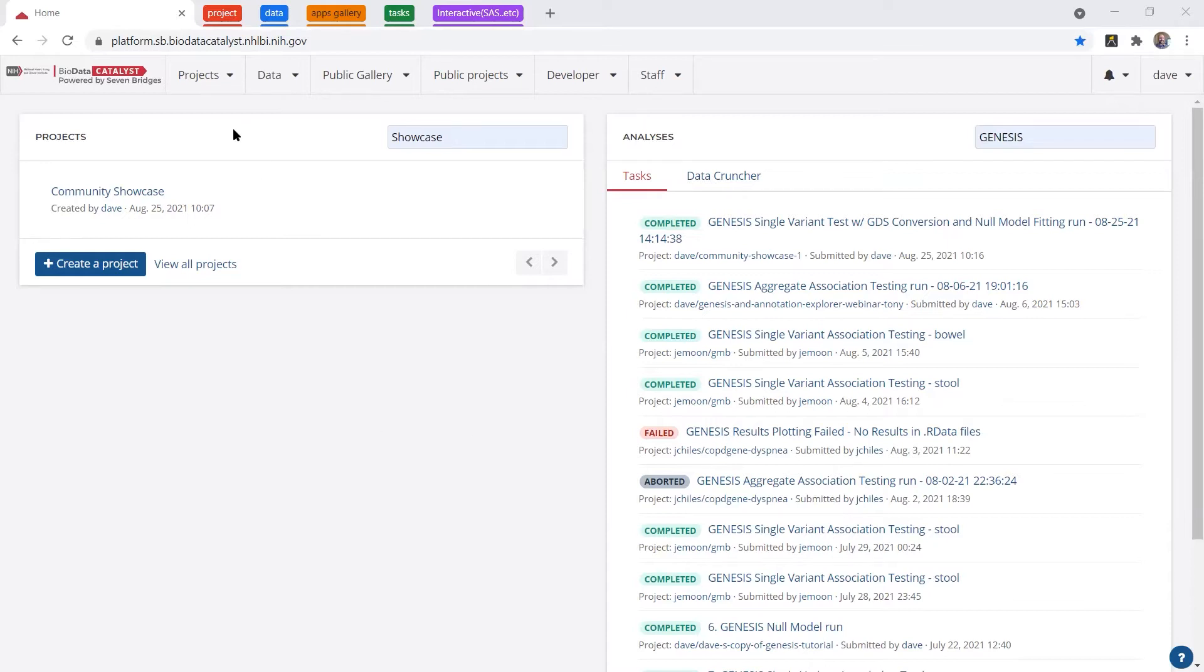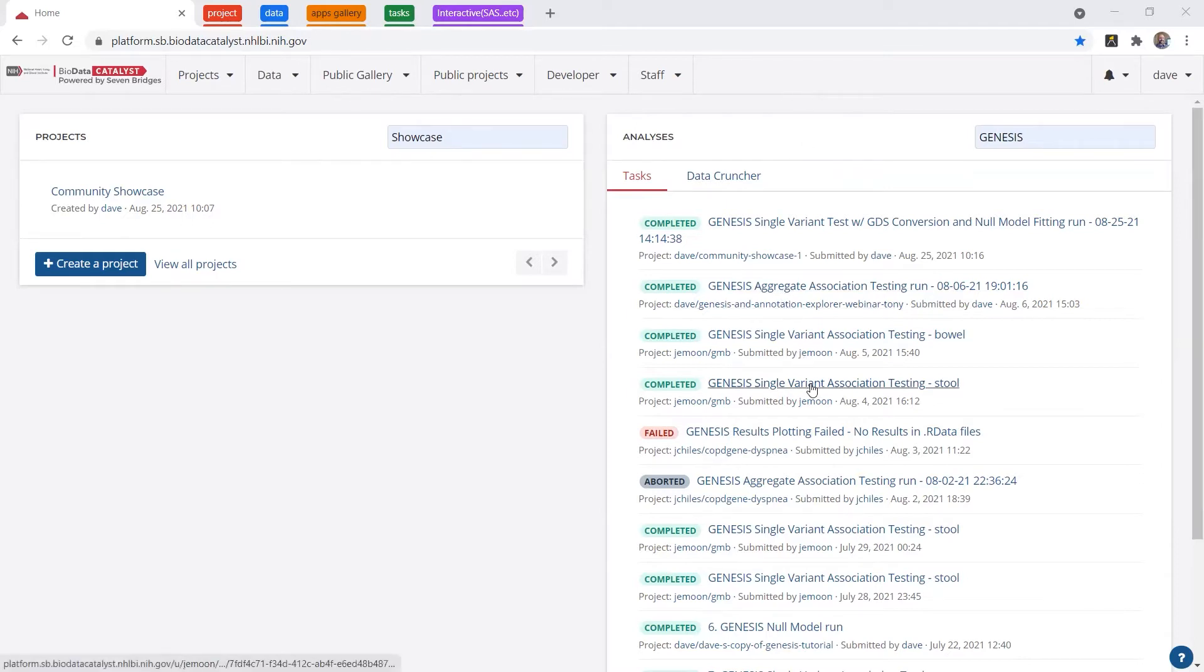When you log on, you'll see your most recent projects on the left side, which you can search, and on the right side, you'll see your most recent analyses, which you can also search via keyword.